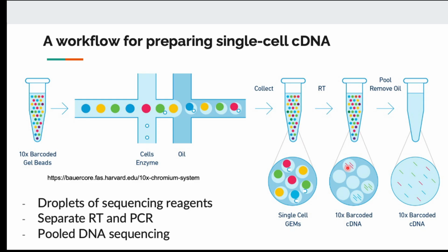And the trick is, if we have to do sequencing separately for each cell, that will be costly because you have to do sequencing many times. So the trick that they are going to do is, in that PCR adapter, they're going to incorporate some kind of barcode, similar to how you do a multiplex experiment. You barcode individual samples, you can mix them, sequence them together, and then you can decode which read comes from sample 1, which read comes from sample 2 by looking at the barcode.